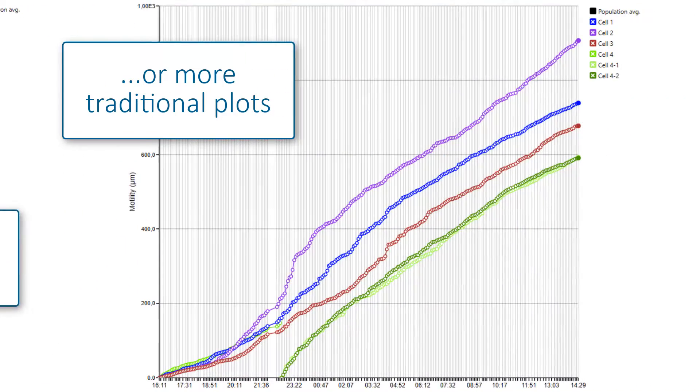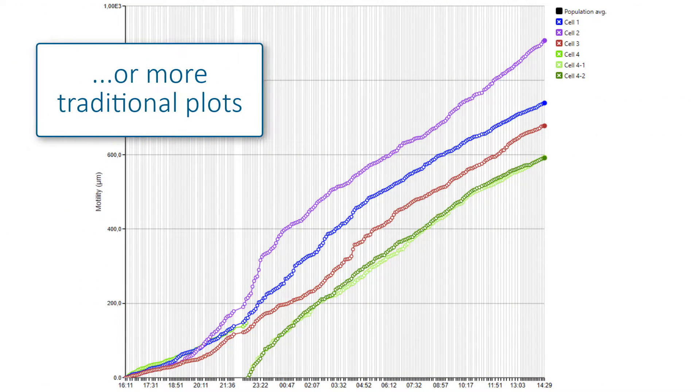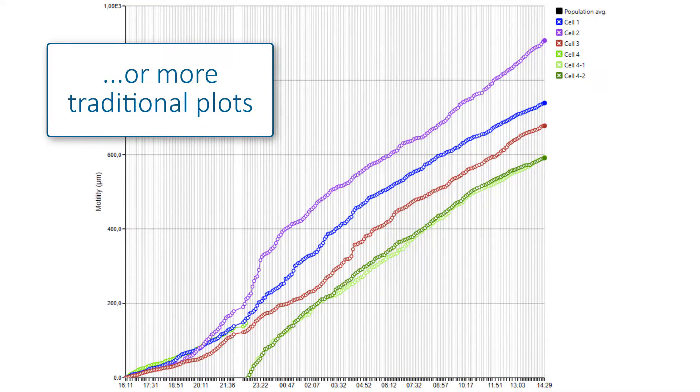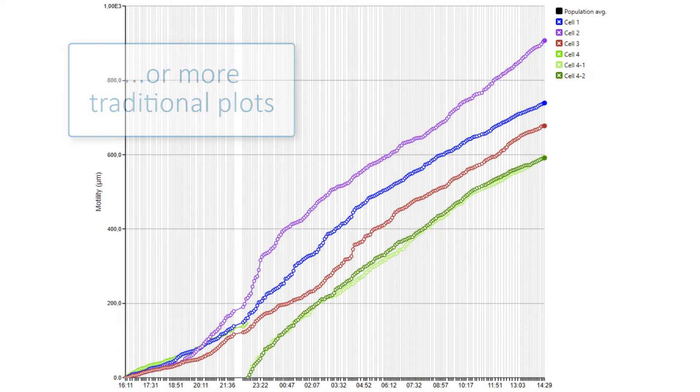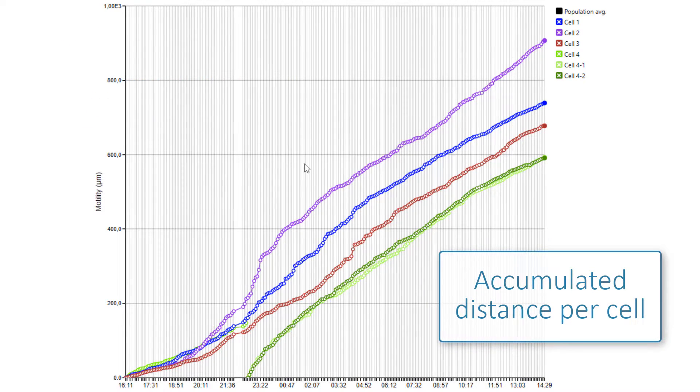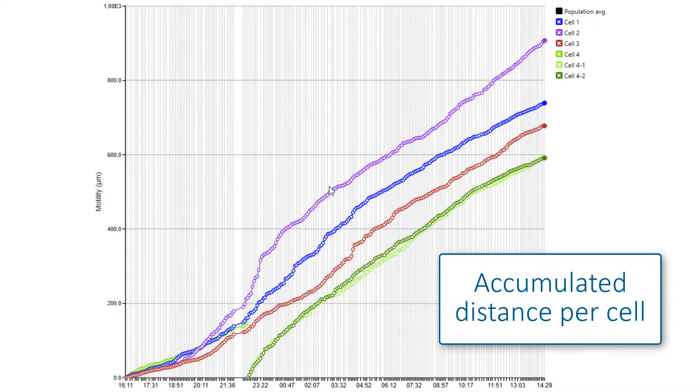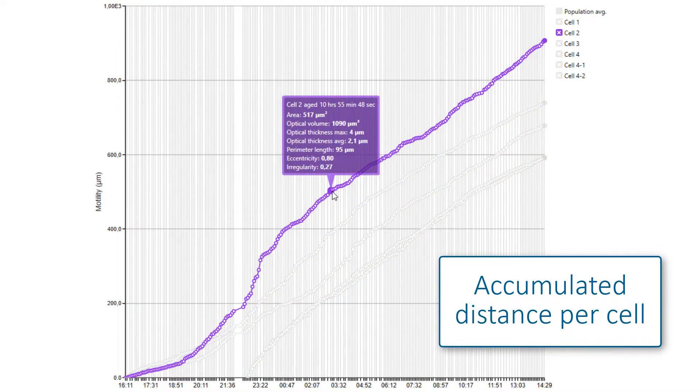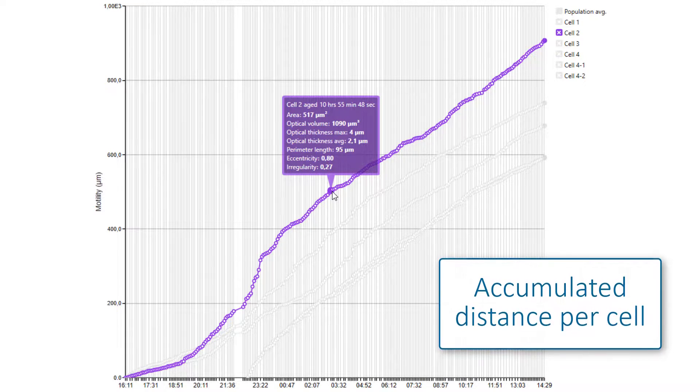You can also get a more traditional plot where any parameter can be plotted against time. Here, the accumulated distance traveled by each tracked cell is shown.